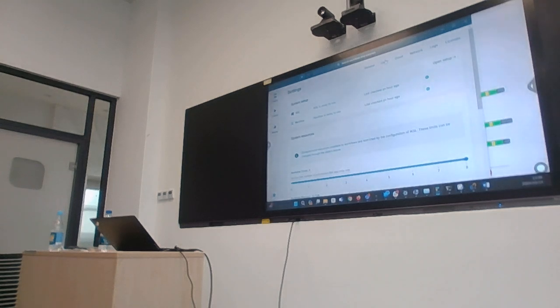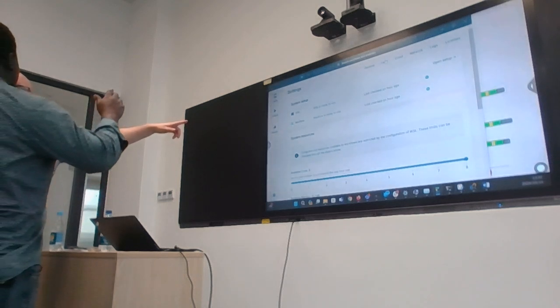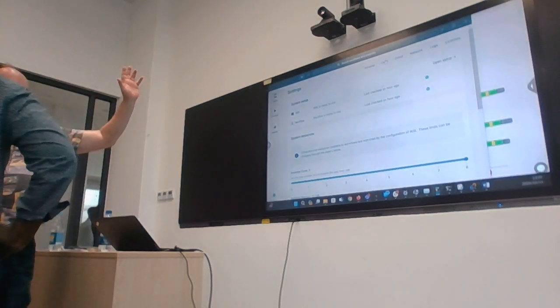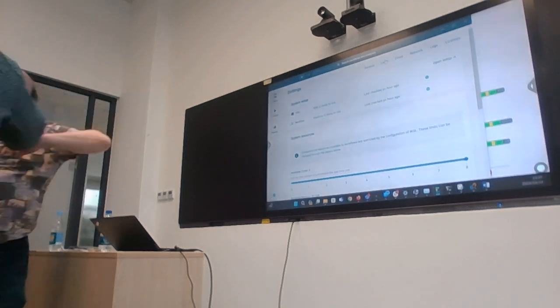But why do you want to adjust it? Well, I think this is Windows, right? This is Windows, so I think the Windows works. But just change the... yeah. No, but that's what I'm looking at here. Okay, I'll come back to that. What I'm looking at here is that Windows is basically using a virtual machine to run everything. I think on Linux it uses the whole computer. So I think that's fine, as long as it says that. Okay.